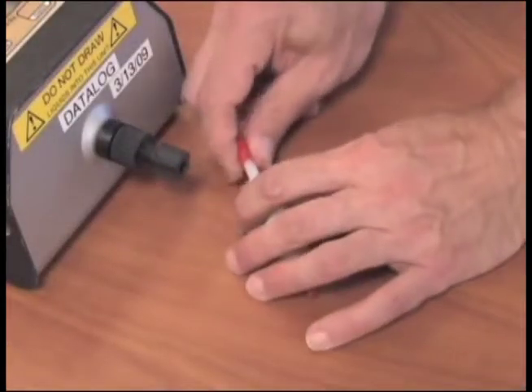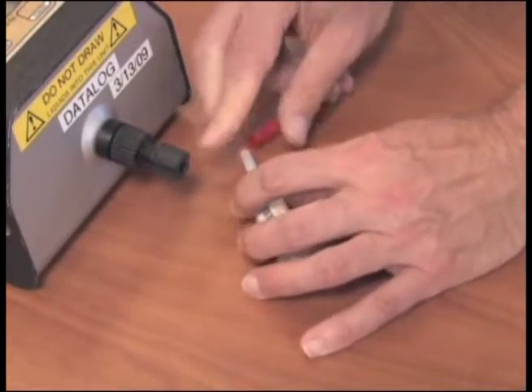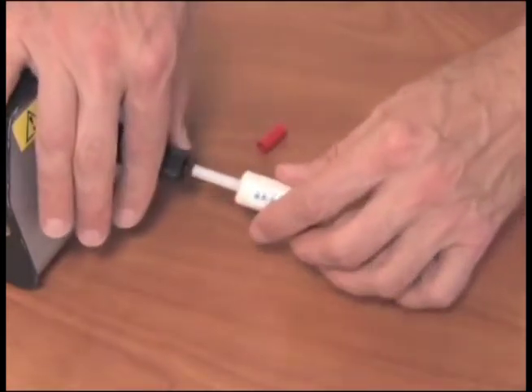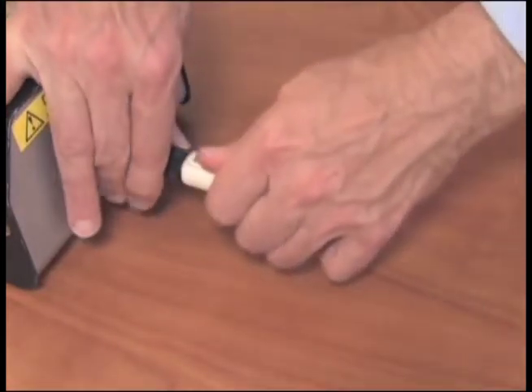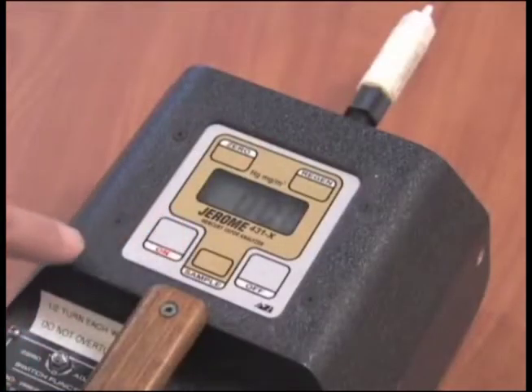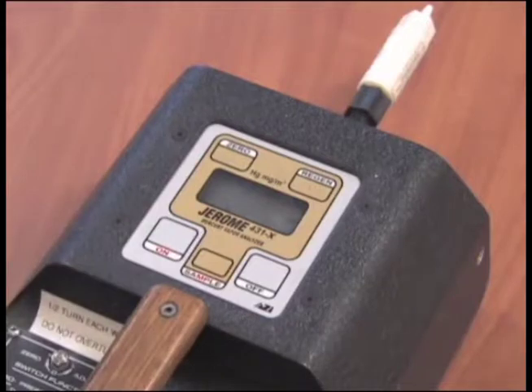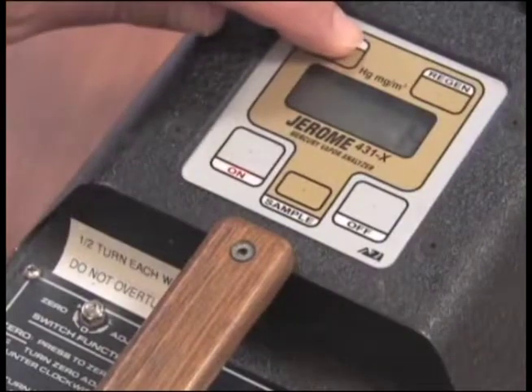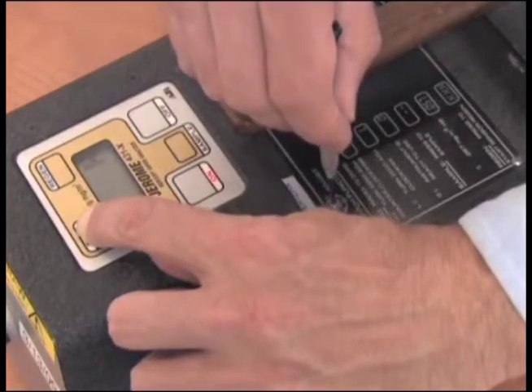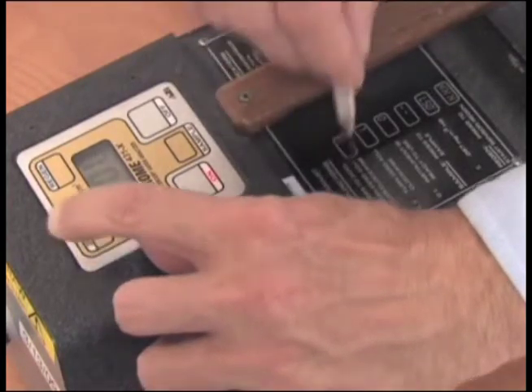You should also re-zero the unit prior to starting your survey. To do this, connect the zero filter and turn on the unit. Press sample. The digital readout should drop to near 0.00. If it doesn't, adjust to zero by holding down the zero button and making adjustments with the zero set screw using the screwdriver. Be careful, as the set screw is very sensitive.